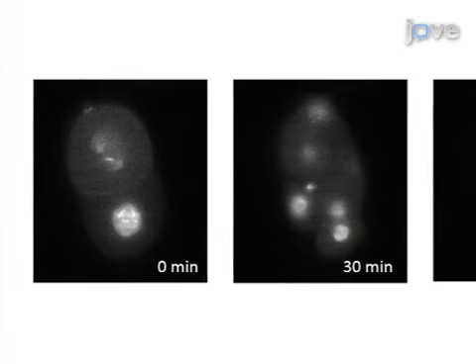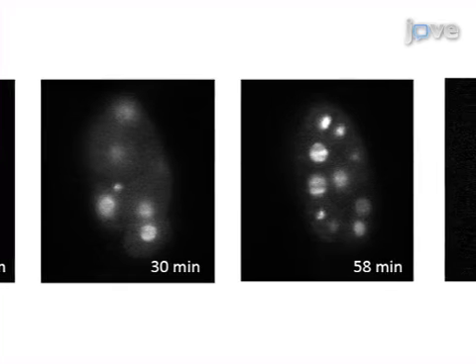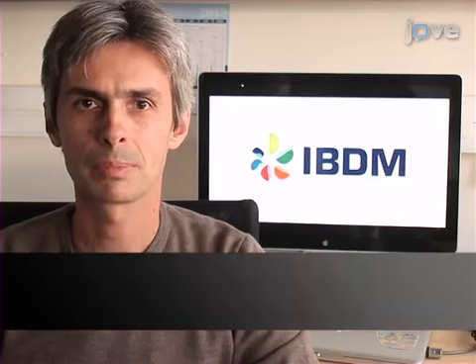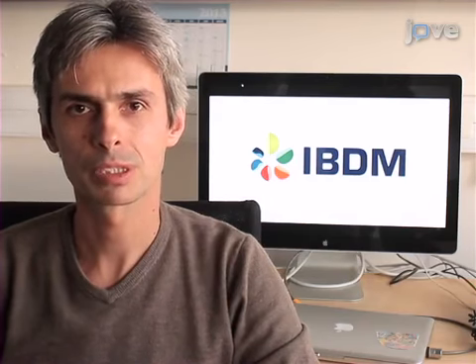The results can show the dynamics of fluorescently labeled proteins during C. elegans development via the analysis of 3D and time-lapse videos. The main advantages of light sheet microscopy over other existing methods such as confocal microscopy is that it allows faster imaging with lower phototoxicity. Though this method can provide insight into C. elegans development, it can also be applied to other systems such as Drosophila or zebrafish.